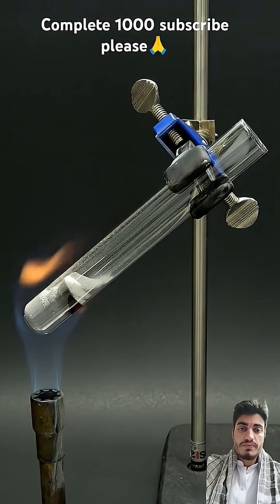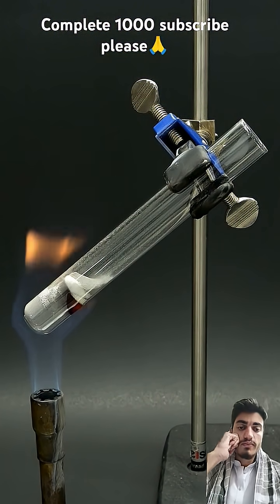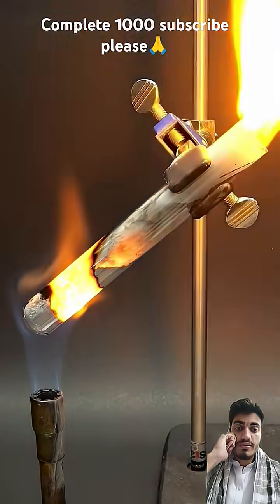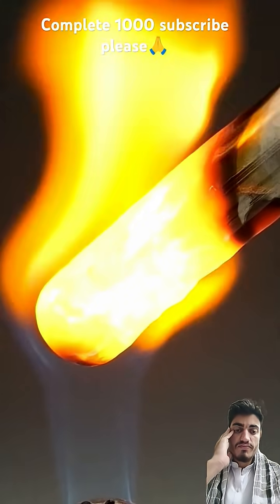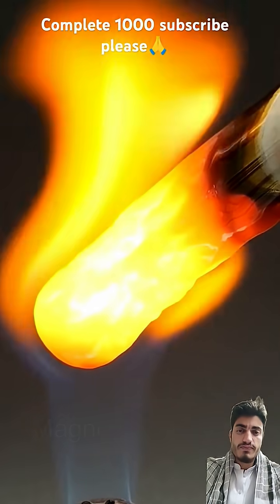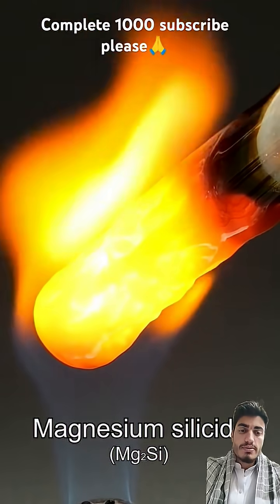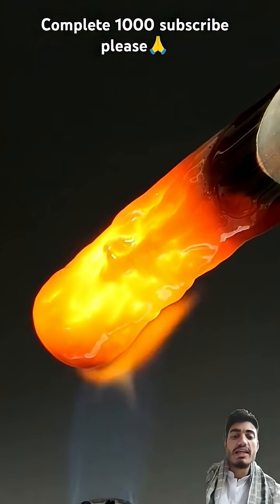I set it up again using much less, and I was a bit worried that this would also explode, except it actually worked. This was because this time, all of the sand and magnesium was thankfully able to react, leading to the formation of something called magnesium silicide, and the entire thing turned red hot.